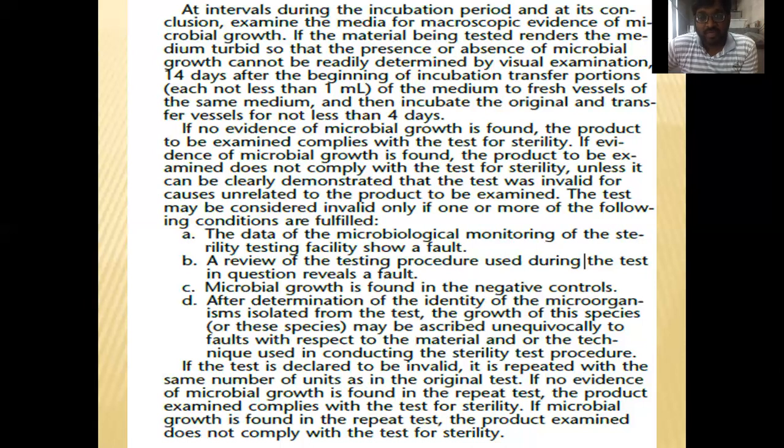So this is a very important test, and it indicates the compliance of the total pharmaceutical asepticness. Whether your system is healthy or not is detected by this sterility testing. Whether your handling is strong or poor is caught by this sterility testing.